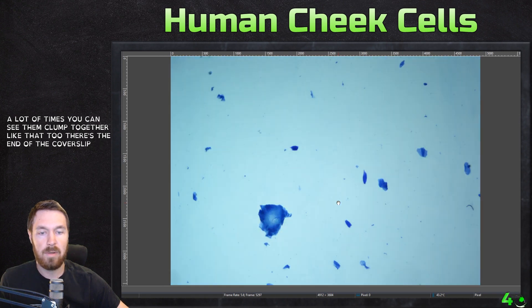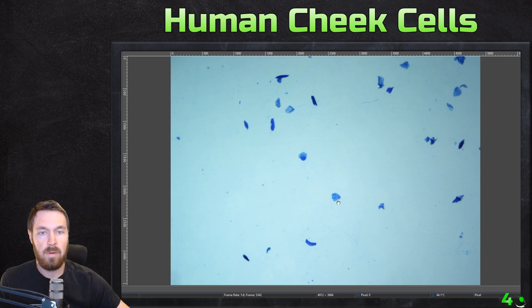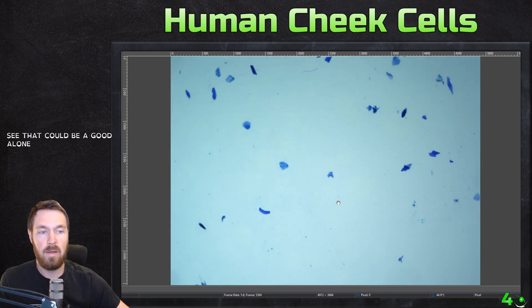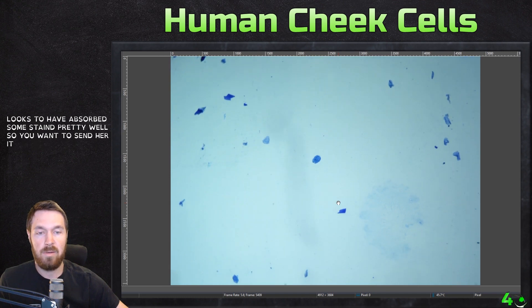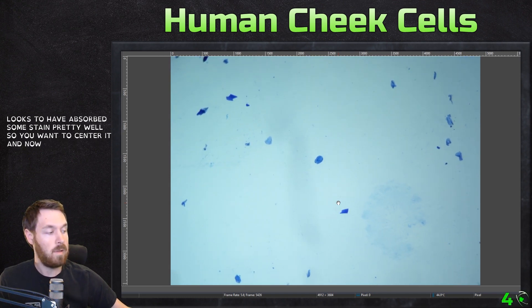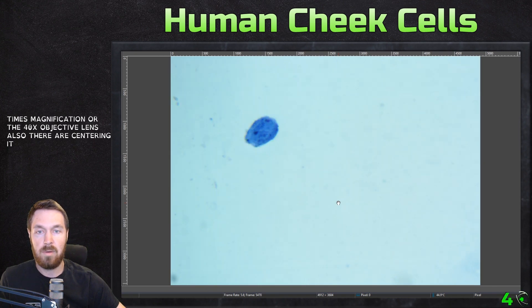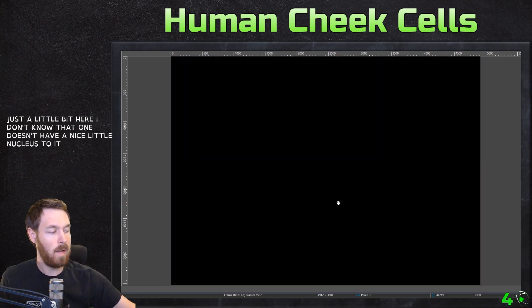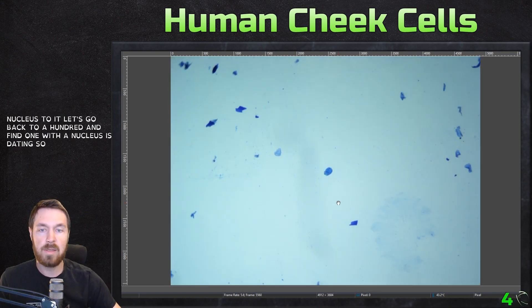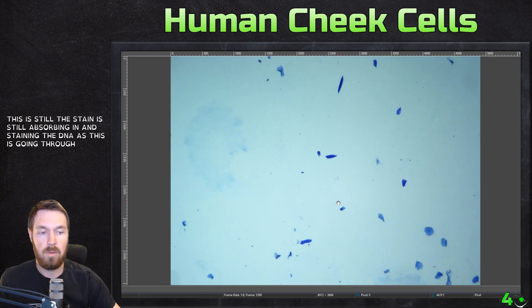There's the end of the cover slip — let's go to the center. That could be a good lone cell right there. Here's a good one down here — this one looks to have absorbed some stain pretty well. Let's center it and go to 400x magnification with the 40x objective lens. That one doesn't have a nice nucleus to it. Let's go back to 100x and find one where the nucleus is staining. The stain is still absorbing in and staining the DNA as this is going through — it does take a little bit of time.